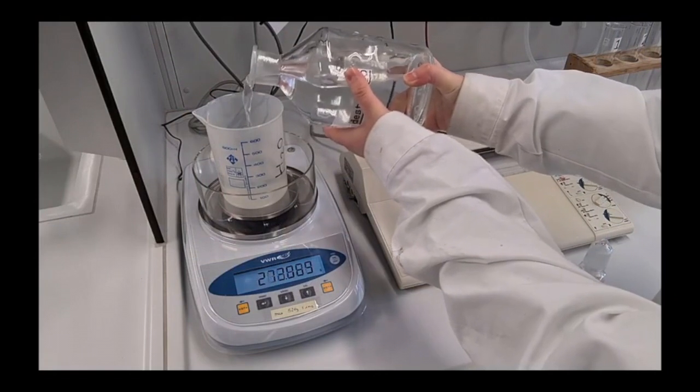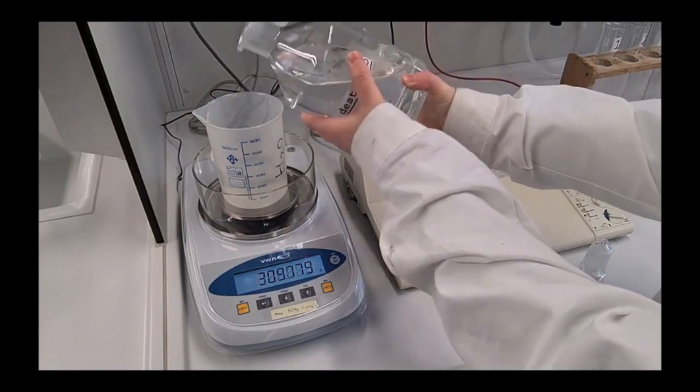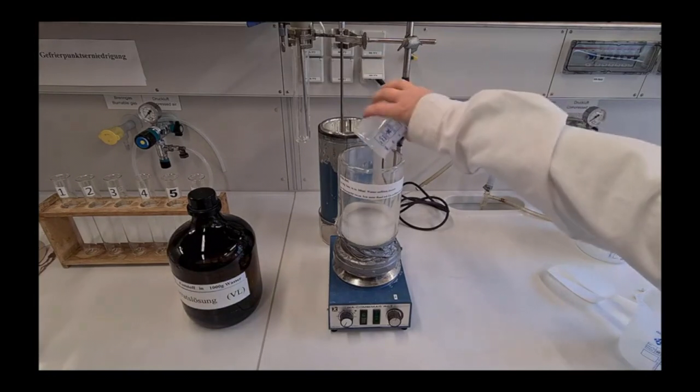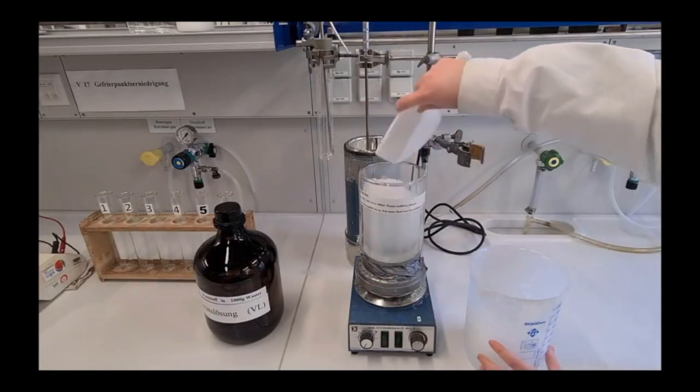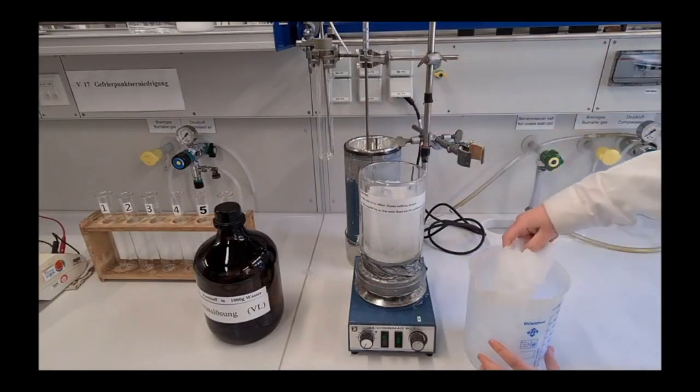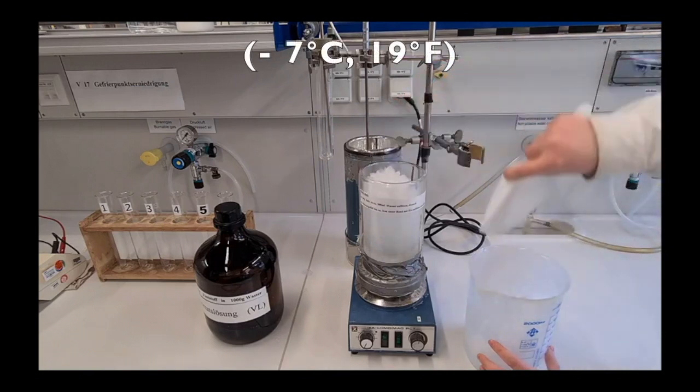For the cold bath, mix 300 milliliters of water with about 60 grams of table salt in the dual flask. Slowly add ice until the cold bath reaches a temperature of negative 7 degrees Celsius.